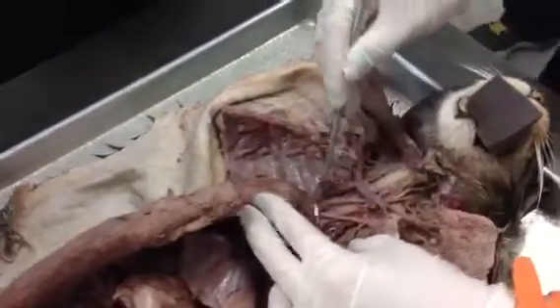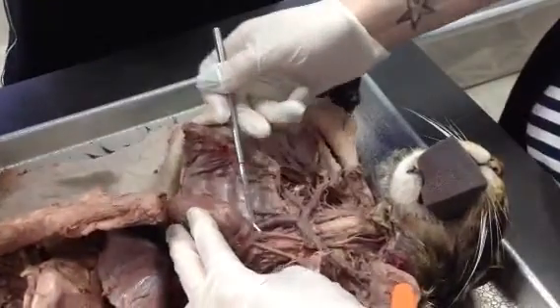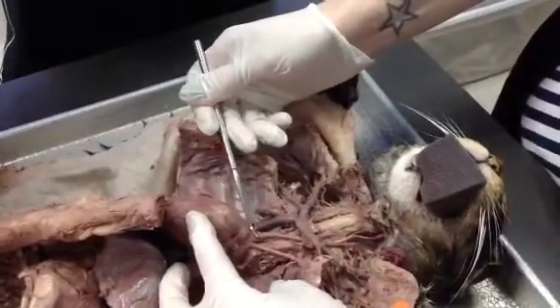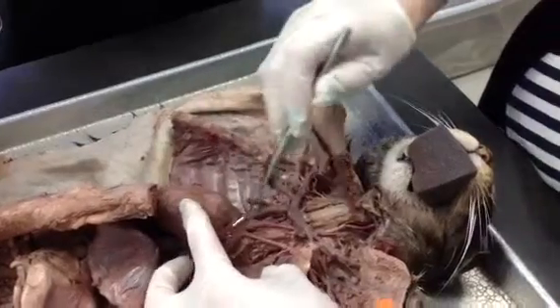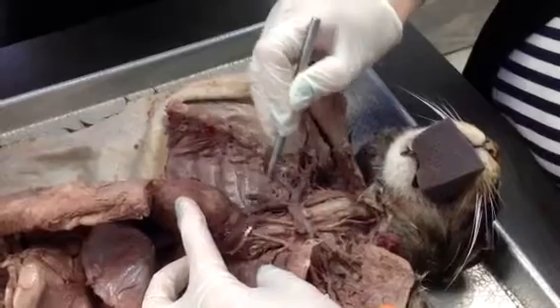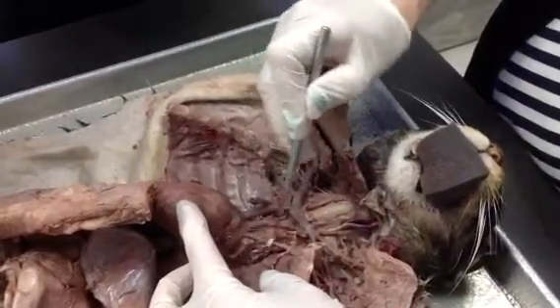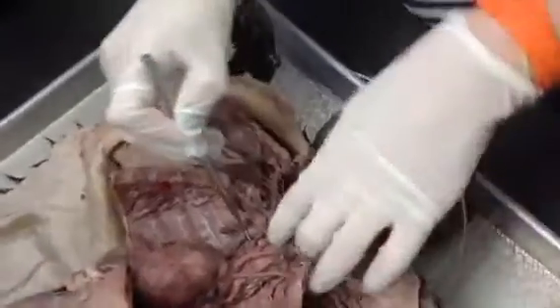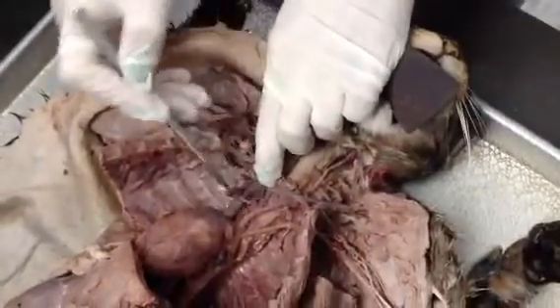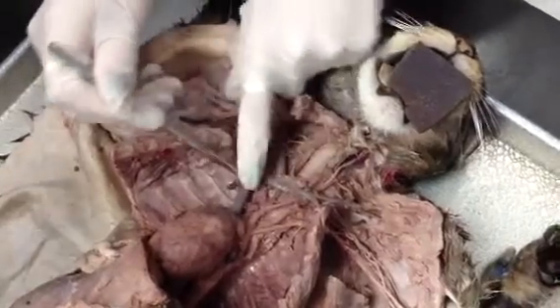So here's the aortic arch. Difference in arteries is there's only one brachiocephalic artery, and this is because the left subclavian comes off by itself of the aortic arch. So here the brachiocephalic, here is the left subclavian. And then if you look up here, it looks like a bird foot or something like that. See here, these three guys.